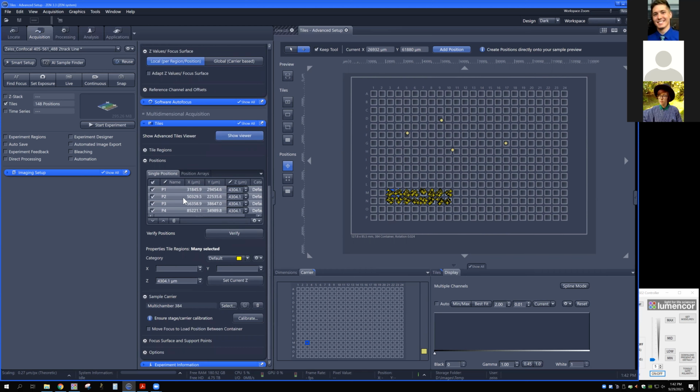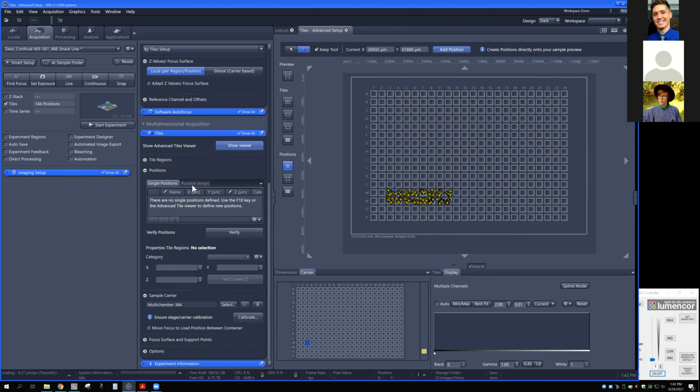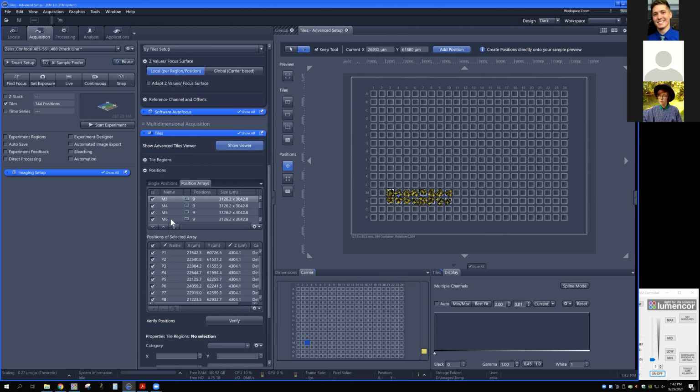And that's the one thing that I wanted to kind of record as well, because there's one step at the beginning that you need to do. Okay. So I just kind of want to show what that looks like. So let me get rid of these positions. That's a good idea. We can do it that way. So let me just get rid of all of these basically. So let me get out of that. Let's go back to here.